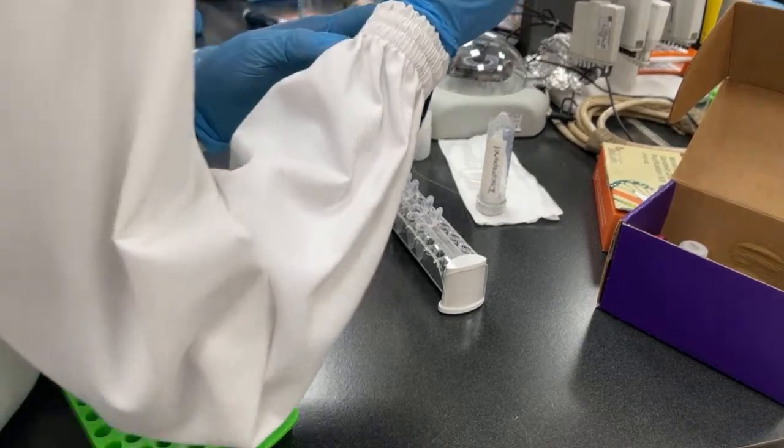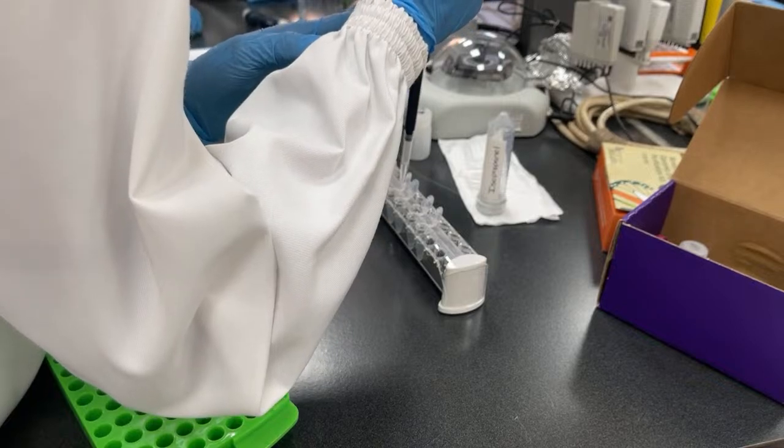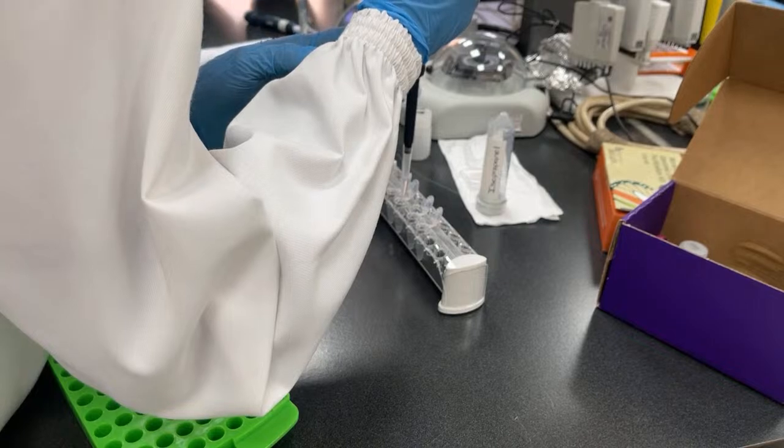Are we washing the disc? Yeah, so you slowly let the ethanol run over the disc. Don't splash, just nicely release the liquid. Okay, that's where we're washing the impurities now.